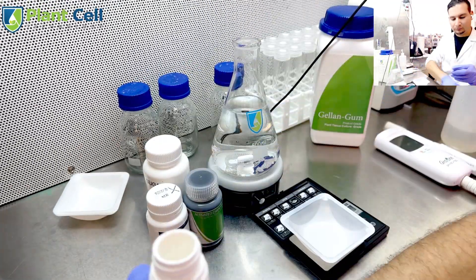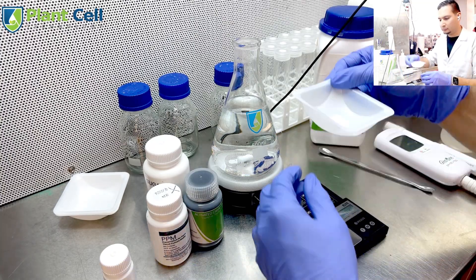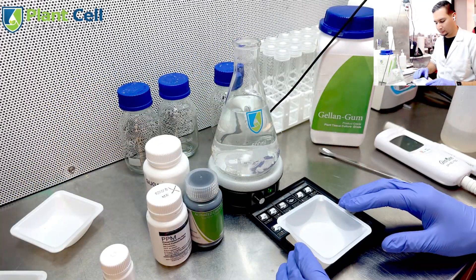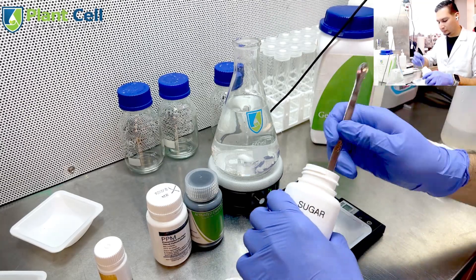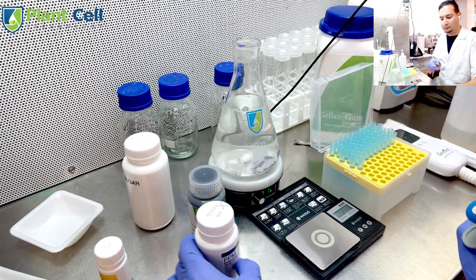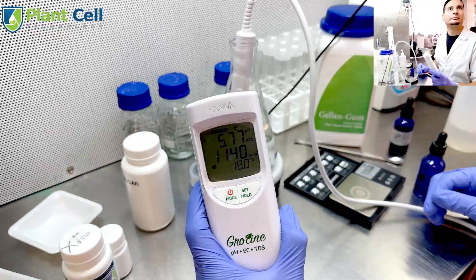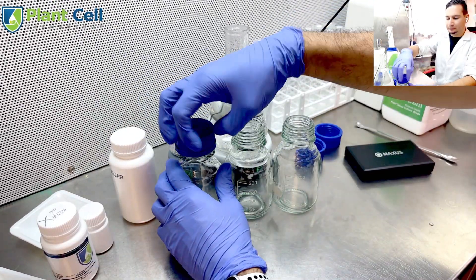The first step is to make plant tissue culture media, or the gel where the plants are going to grow in. This gel contains all the nutrients necessary for the plants to grow and stay in the tubes for a long period of time. The materials are MS media from Plant Cell Technology, sugar from the grocery store, and PPM — Plant Preservative Mixture from Plant Cell Technology — which is going to prevent the growth of fungus and contamination.